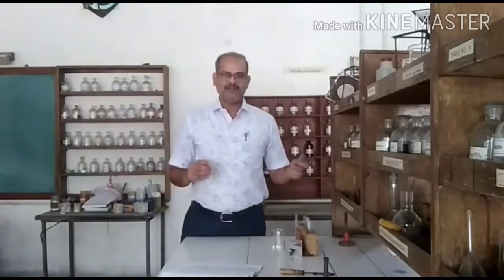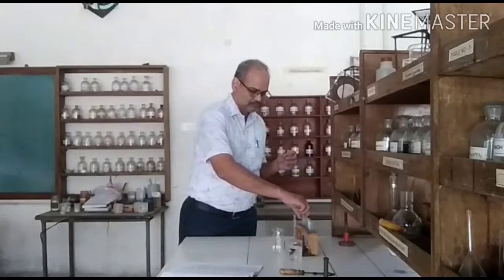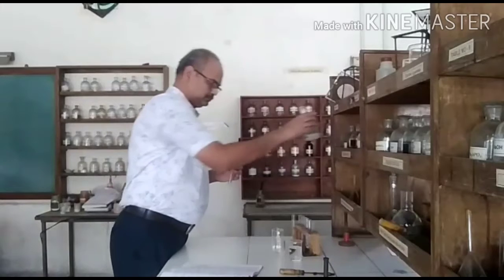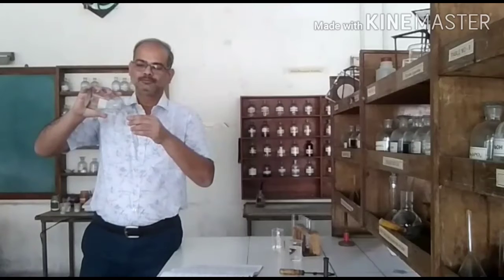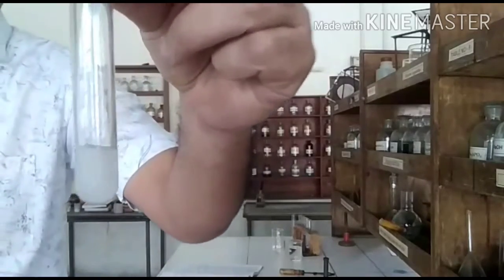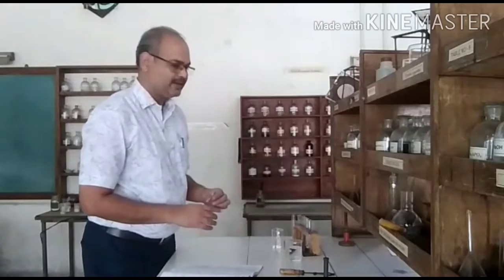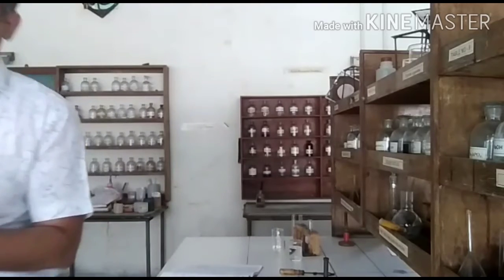Now what I will do? I will take a small quantity of precipitate in another test tube, and I will check its solubility in dilute HNO3. It should be insoluble. Dilute HNO3 is on your rack. Now if you see, on adding dilute HNO3, it has become dark white in color. That means it is insoluble in dilute HNO3. Now I have to check whether it is soluble in hot ammonium acetate or not. I just wash this test tube, children.